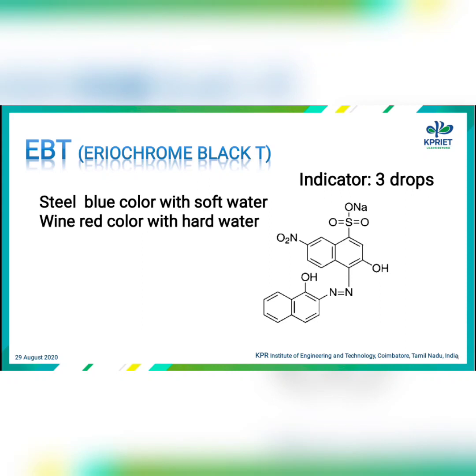EBT is used as the indicator. EBT stands for Eriochrome Black T, which is steel blue in color. When it is added to hard water, it forms a wine red color.